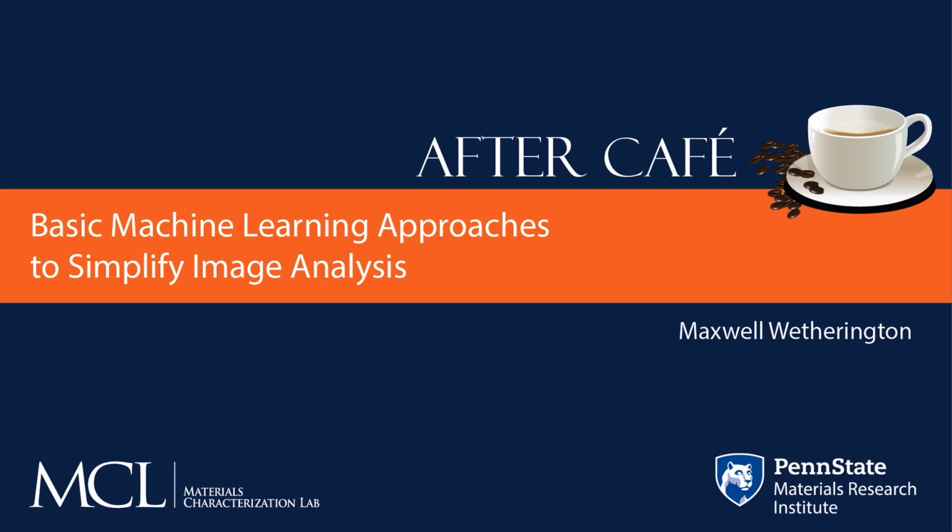Hi, my name is Max Wetherington, and today I'm going to be talking with you about basic machine learning approaches to simplify image analysis. Before we begin, I just want to preface with saying that I'm not a computer scientist. One of the main messages of this presentation is that it's not necessary for you to have knowledge in computer science or machine learning in order to use these user-friendly tools for image analysis.